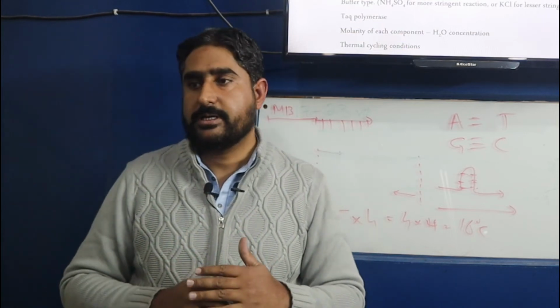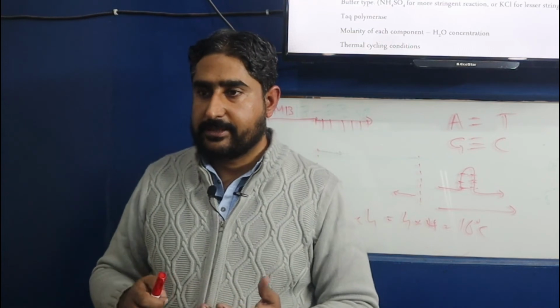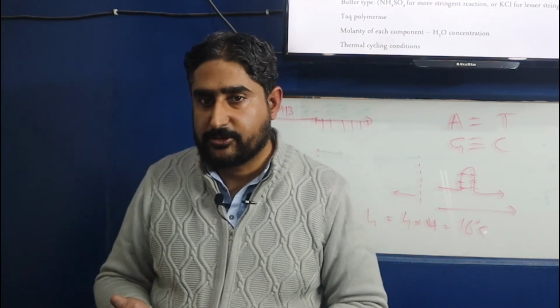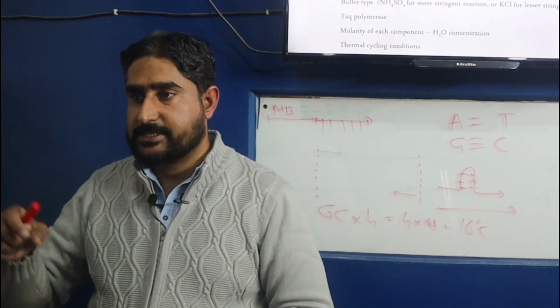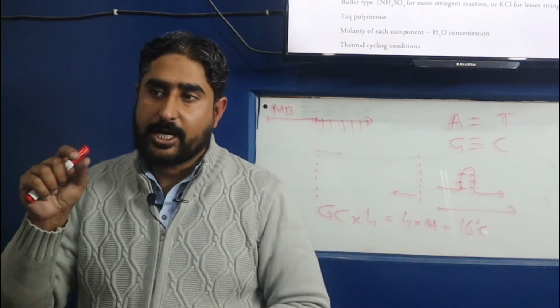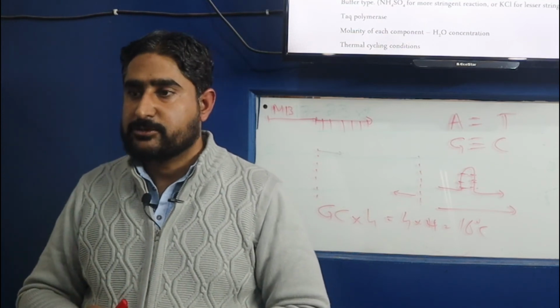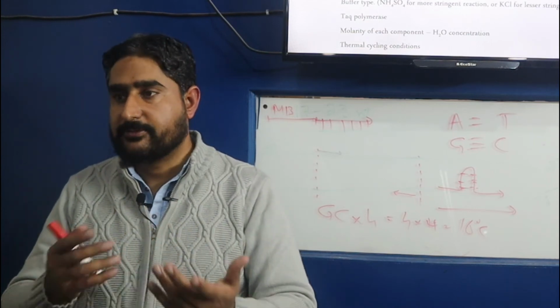Compared to those, for bigger template DNA, for example, if we want to amplify DNA from the wheat genome, or from the onion genome, or from the human genome, which are sizes in the range of GBs, 3 GB, 6 GB, to even 15 or 17 GBs of DNA, that means the total number of copies of that particular gene in the available DNA will be lesser. So we need to work around the appropriate concentration of the primers depending upon the type of DNA.